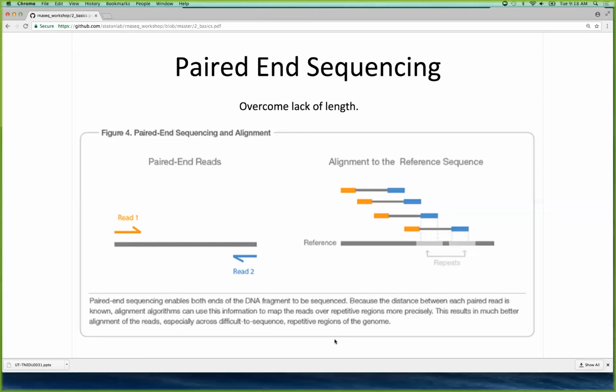So the new long read technologies, which are nanopores, are a completely different approach. They've almost completely discarded the Illumina approach, and they have little nanopores that ratchet the DNA one base at a time through and measure the electrical discharge as each nucleotide goes through. So it's a completely different technology. From what I've heard, the Illumina technology will never yield long reads. The industry has started over too.